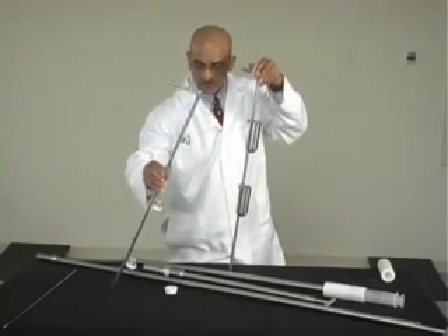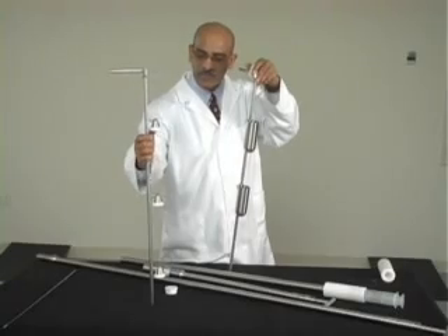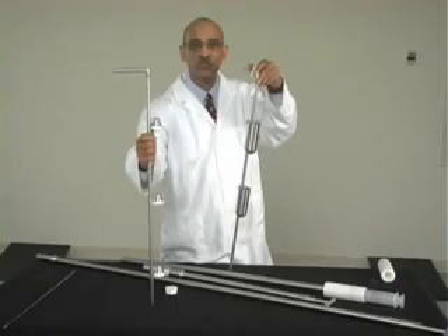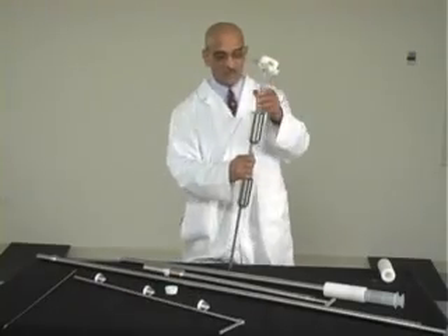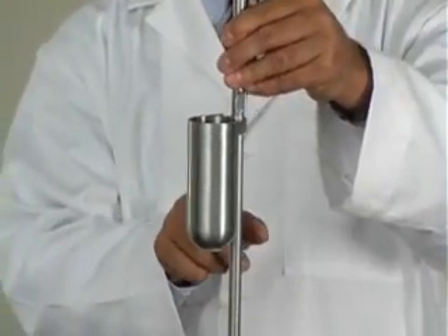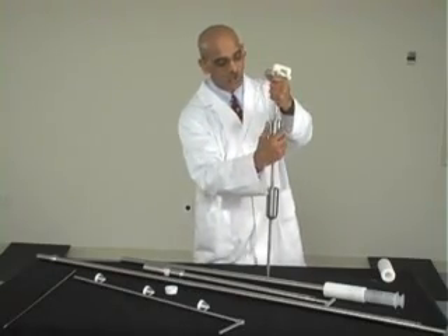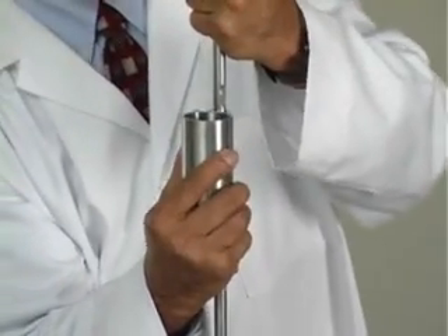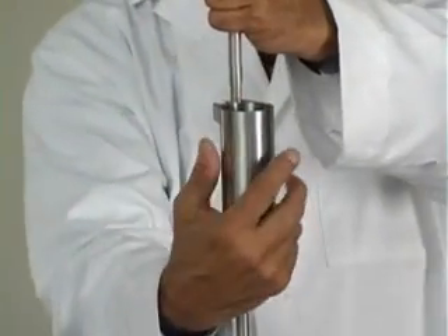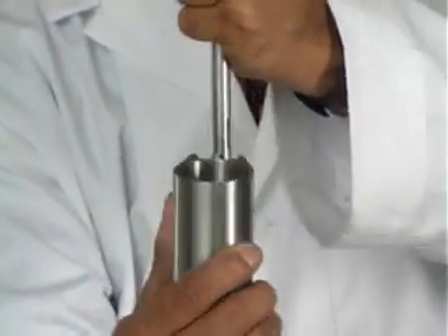That is the shaft that actually holds the caps. Each stainless steel cap has a threaded nylon piece, which provides a seal when we close the bottle. This is the shaft that holds the cups in place, but the cups are removable also. When you want to remove the cup, you hold the cup at the bottom, push it up a little bit, and there are two flats here. So push the cup up onto those flats, and then you just slide it out.